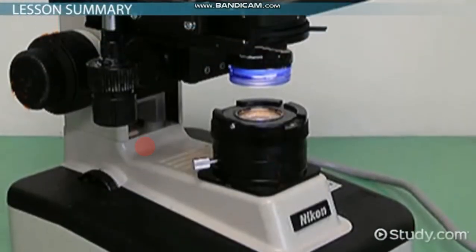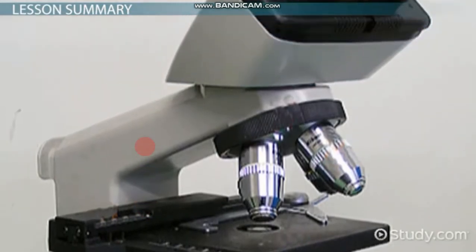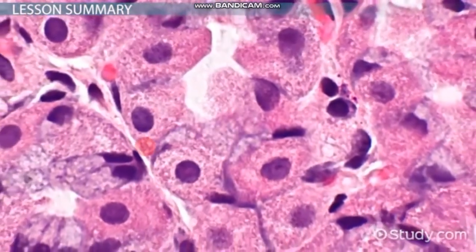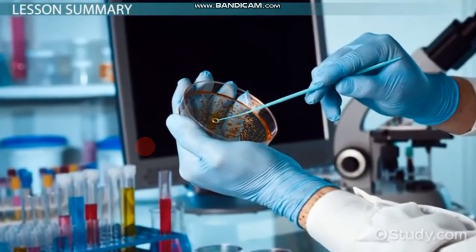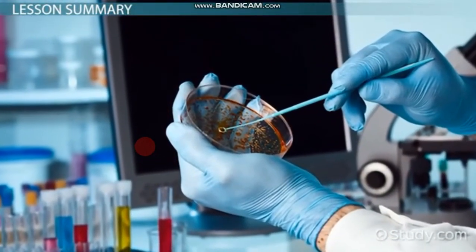Light microscopes work by transmitting light through a very small or very thin object and magnifying the image that is created with a series of lenses. Light microscopes are widely used in a variety of applications, especially in the field of biology.